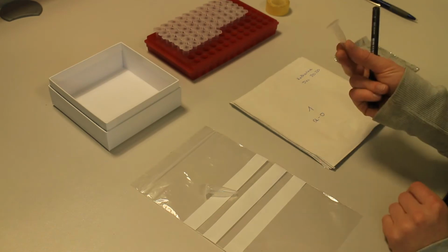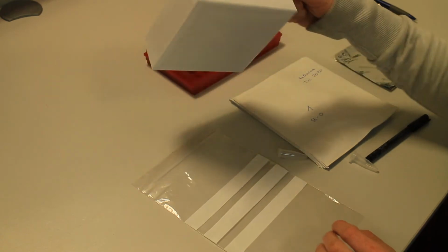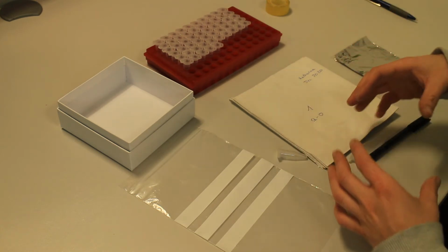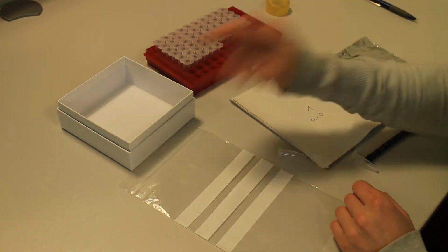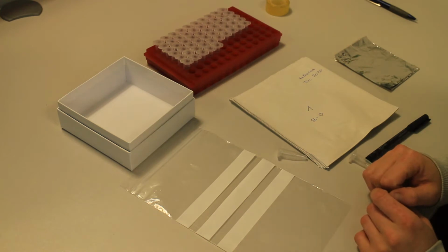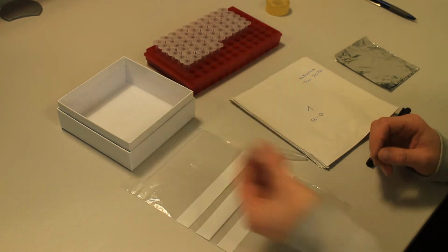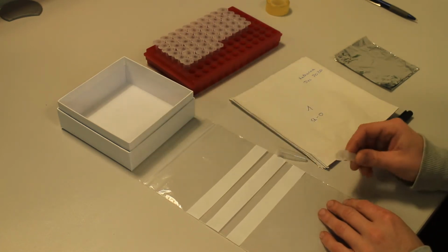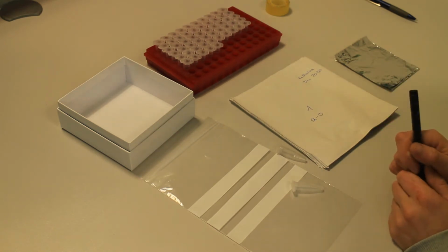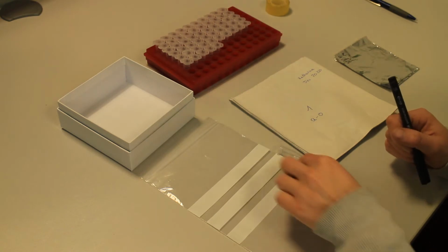For the small vials, you will probably either store them in a box like this or in a bag like this. So you will have them grouped for experiments. But these boxes can open, the bags can open, there's sometimes a mess in freezers. And if you lose one or two of these vials from one of the bags, you would like to be able to recover them. So you would like to be able to find them and determine that this sample is of exactly that experiment.